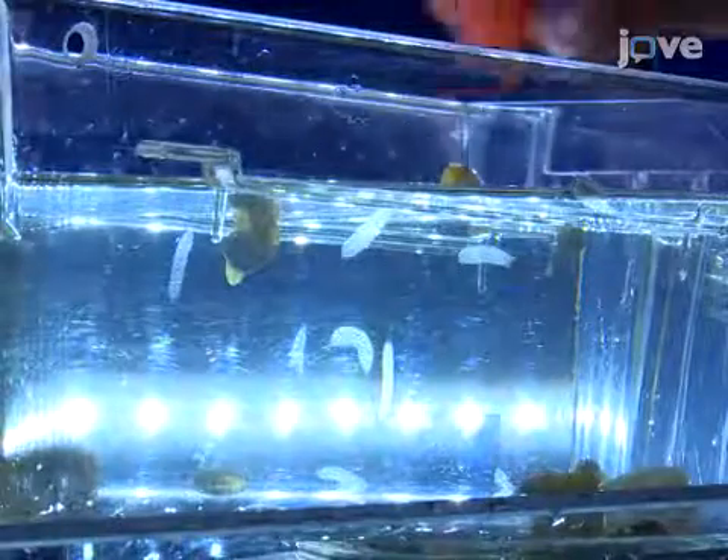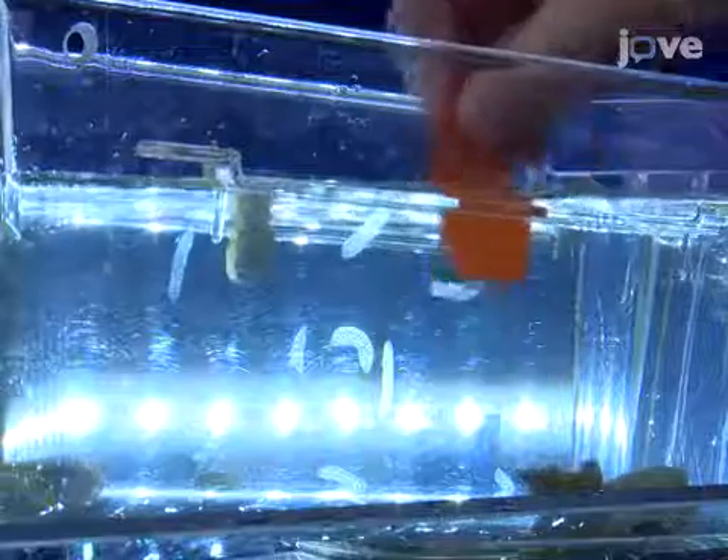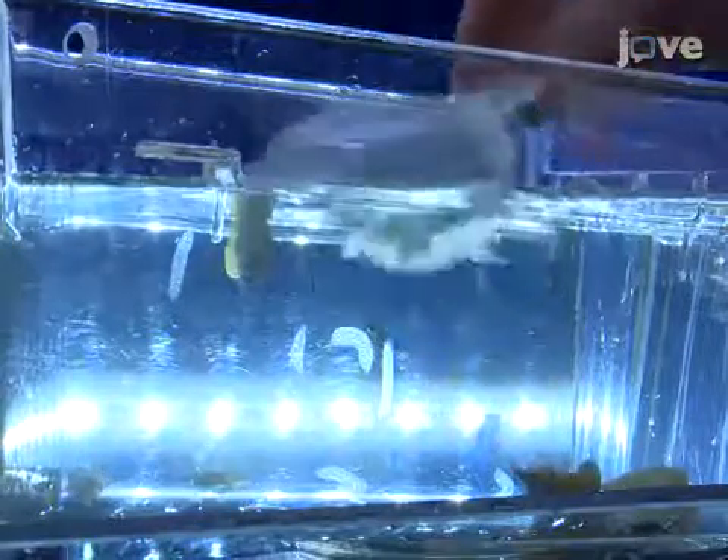To collect the egg strings from the walls of an aquarium, use a piece of flat, flexible plastic as a spatula to scrape the egg string off the substrate, and use a plastic tea strainer to fish the floating egg string out of the water.